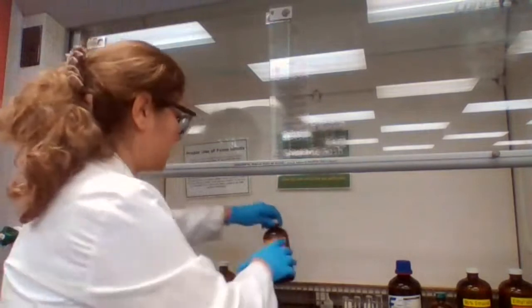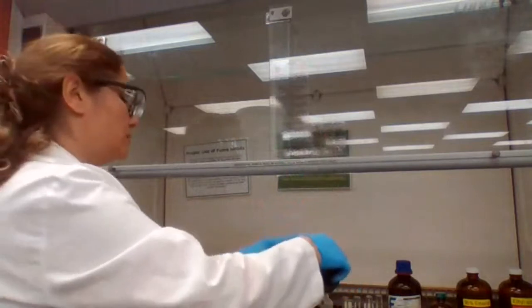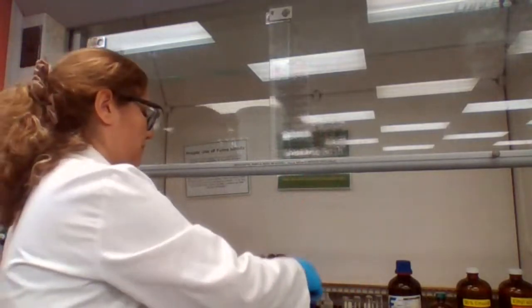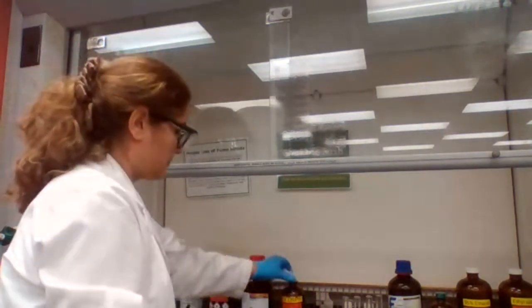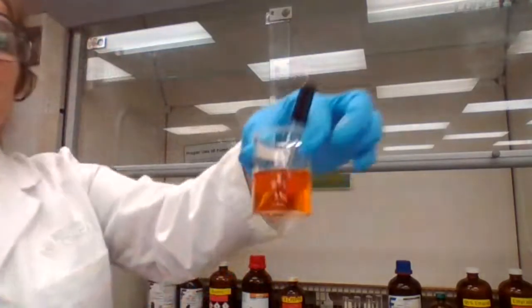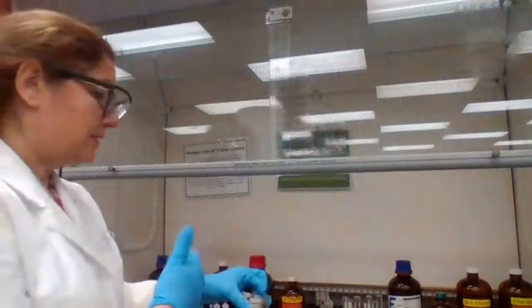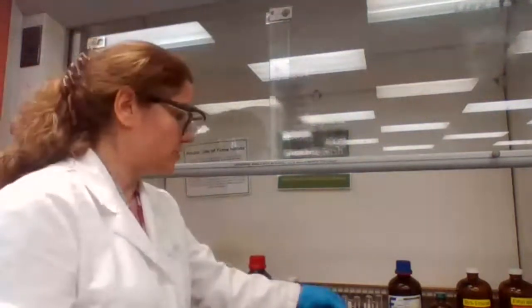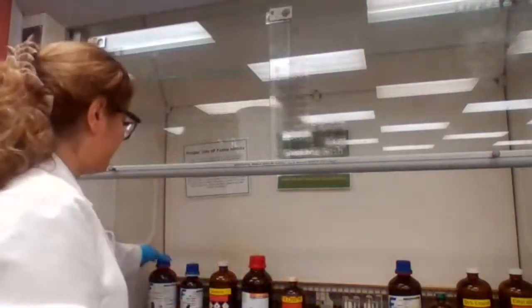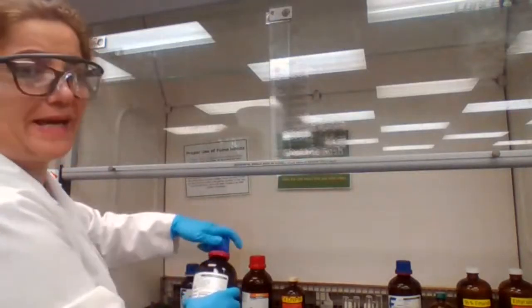Four to 5 drops of the liquid and 1 milliliter of the DNP. So we have our DNP reagent here. The DNP reagent is orange in color, but it is clear, so it's not cloudy. The positive test is not the color, it's the texture. So we have to make sure that we are getting the precipitate for it.